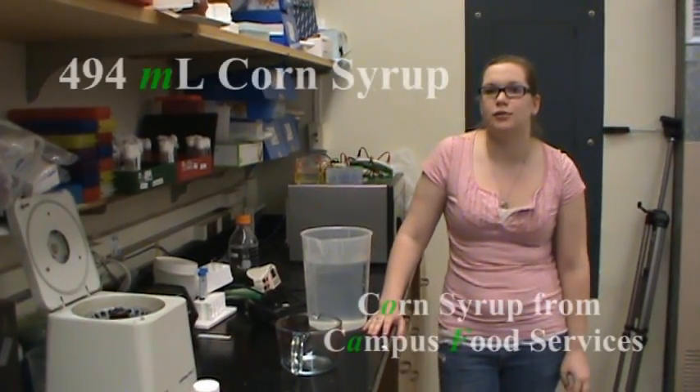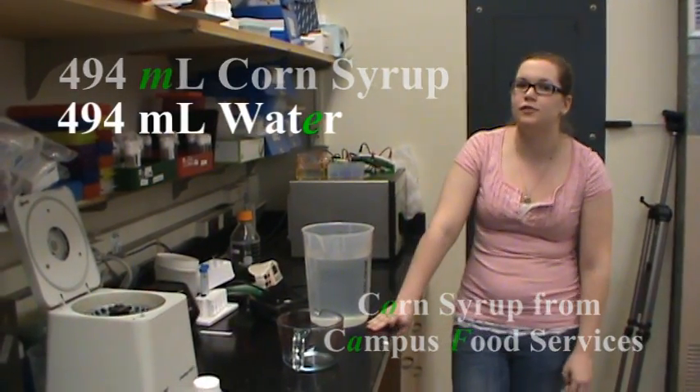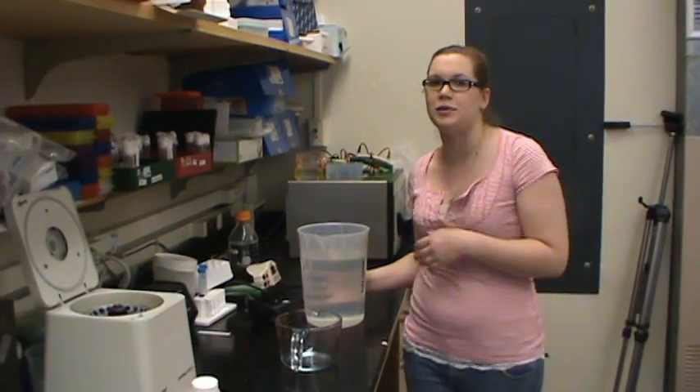Today we're going to be using 494 milliliters of corn syrup. To decrease the viscosity, we're going to be mixing that with an equal volume of water, which we are going to heat first so that we may dissolve the corn syrup in it.